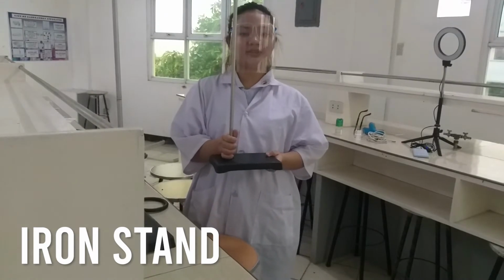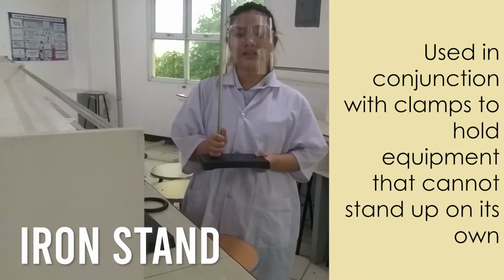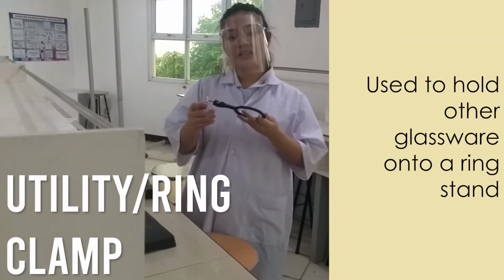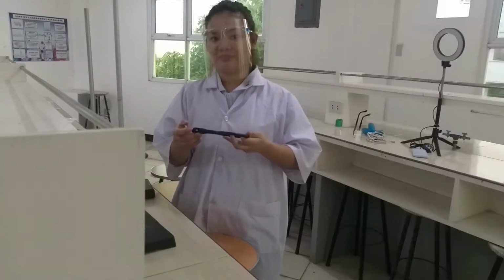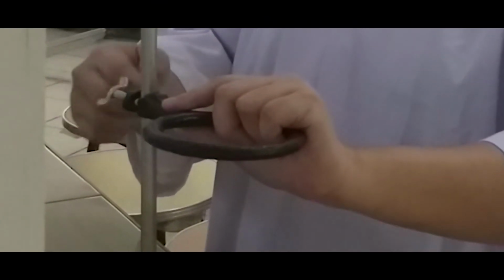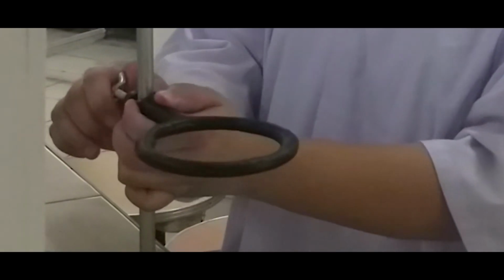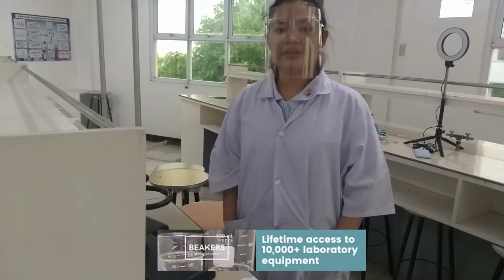It is used in conjunction with other clamps to hold equipment that cannot stand on its own. Lastly, the utility clamp, also known as the ring clamp. It is attached to an iron stand to hold glassware that cannot stand on its own. And those are the commonly used equipment for titrations.